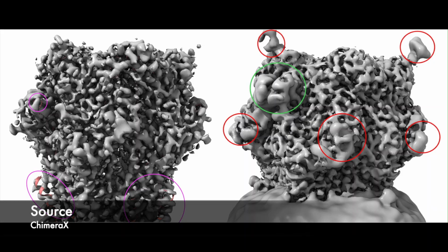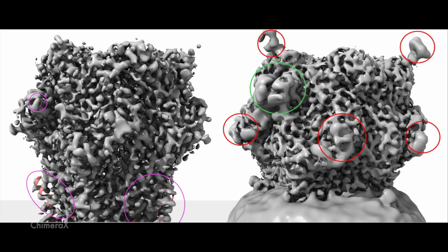But from there, we can tell based on that local resolution I just showed you that the structure is decently well resolved, and we can start looking for where this toxin actually binds. So this is what I'm showing you here in this image. You see this grayish blob, that's the EM density map. And I've circled in pink the ribbon structure, or just the carbon backbone of the receptor, which I superimposed and put inside of the EM density map.